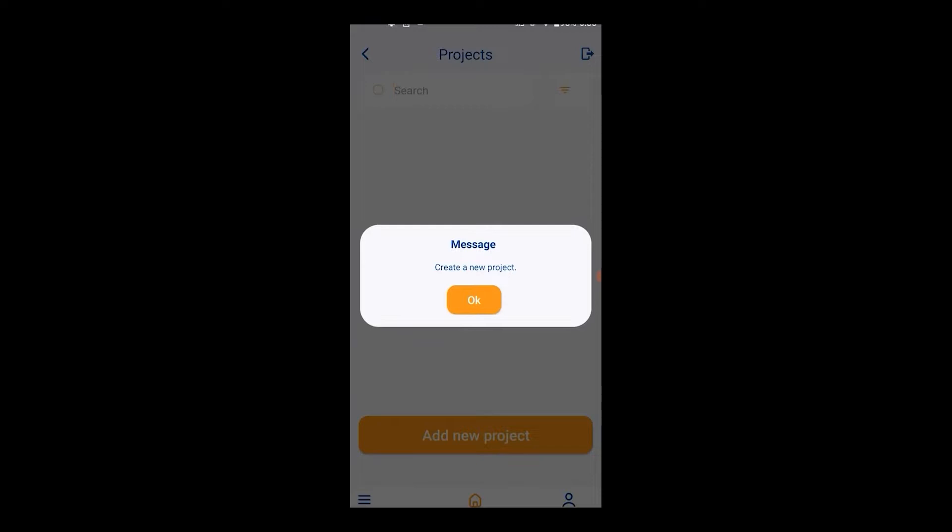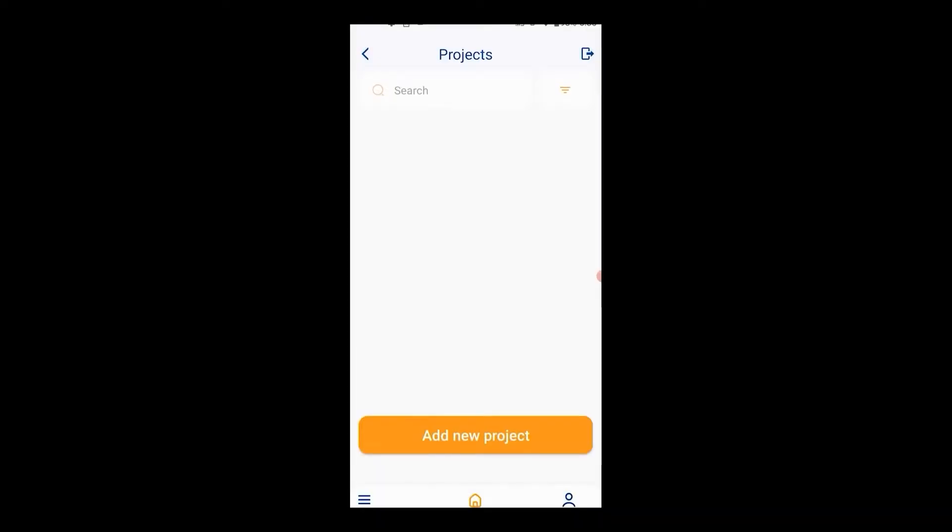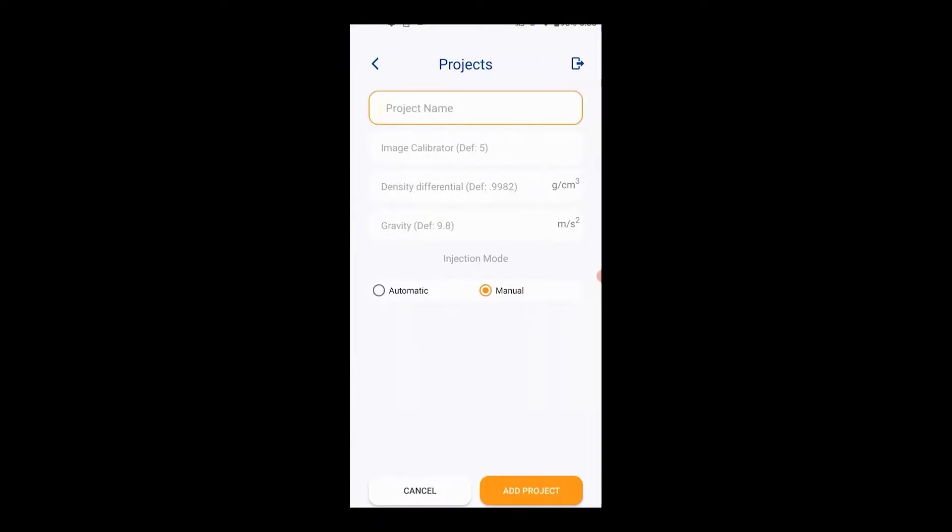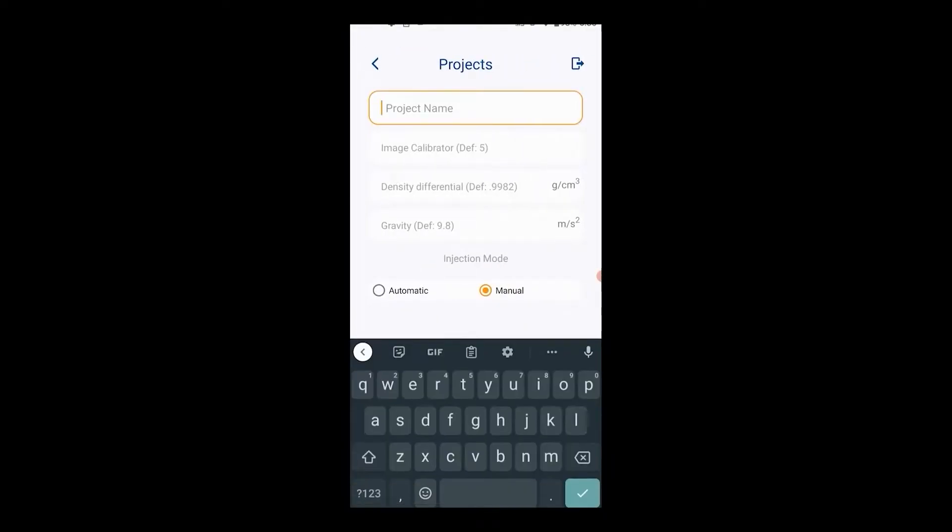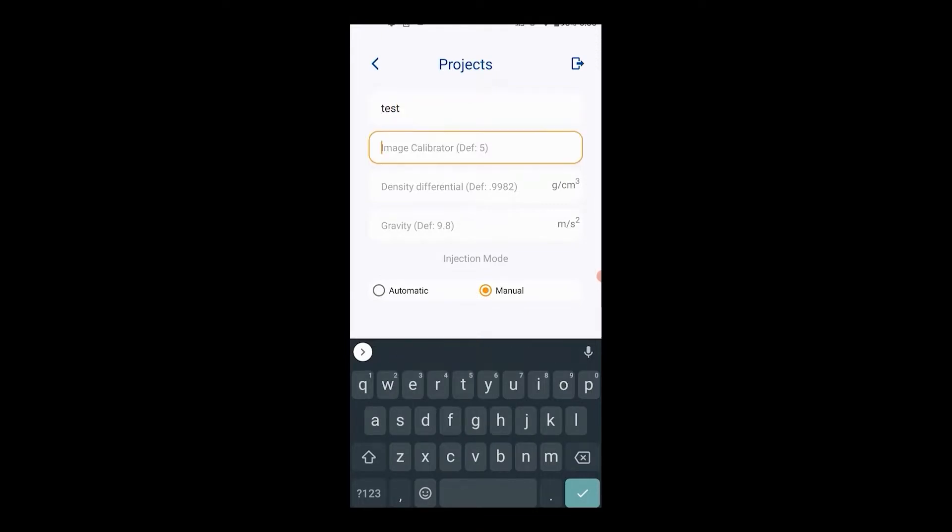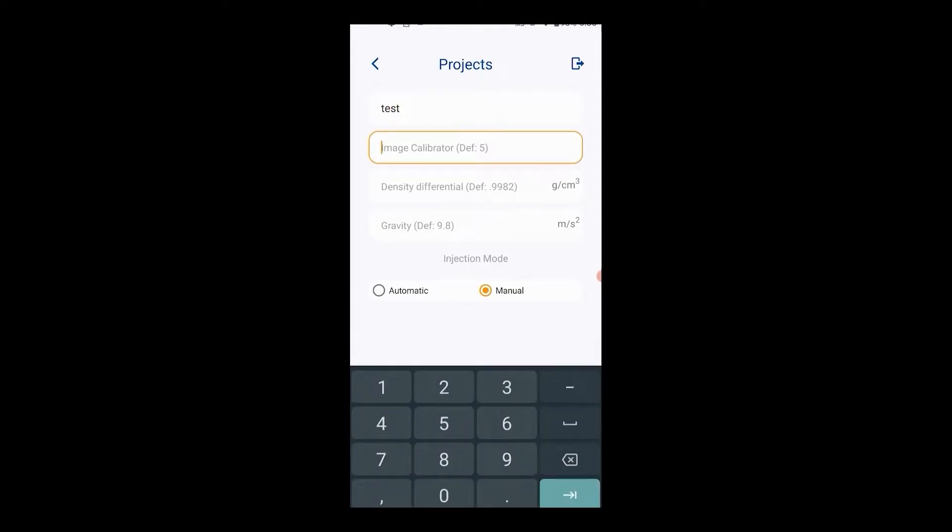After creating an account or signing in, create a project. This includes the project name, the image calibration number, which is the outside diameter of the needle being used in the experiment.